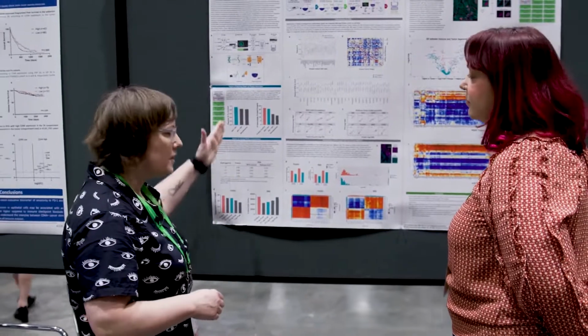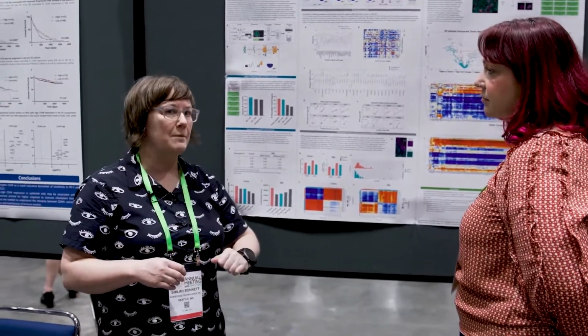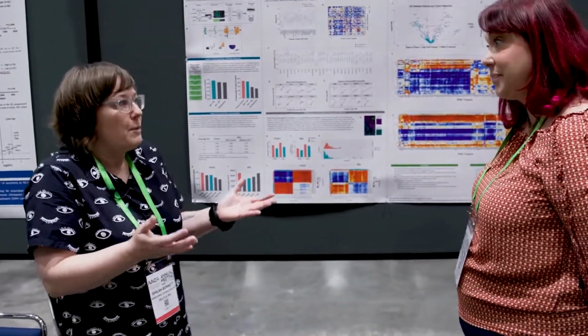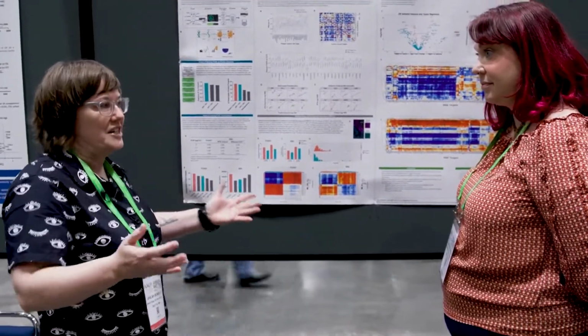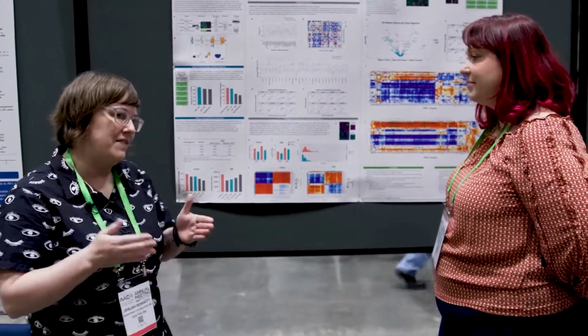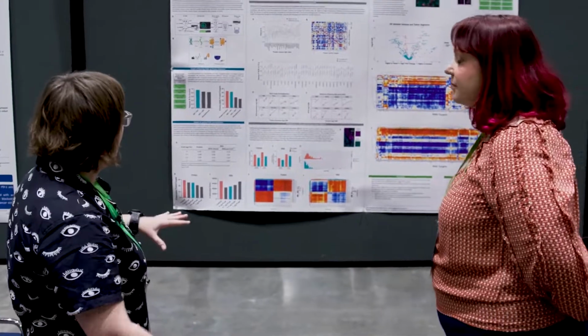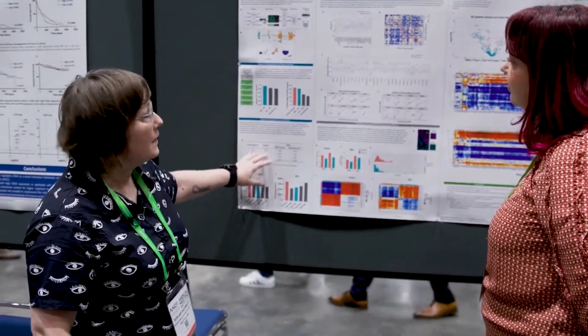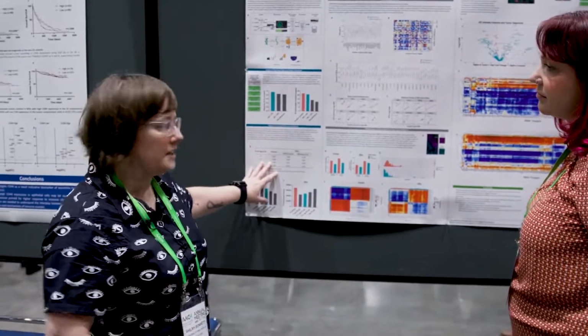The first one is focusing mostly on the technical development, because we need to know whether these two analytes are going to play nice together, because they both want two different conditions. Exactly. So we had to find that middle ground, which was a balancing act, but doable. And so this is the first part of the poster. It kind of goes over that technical development.